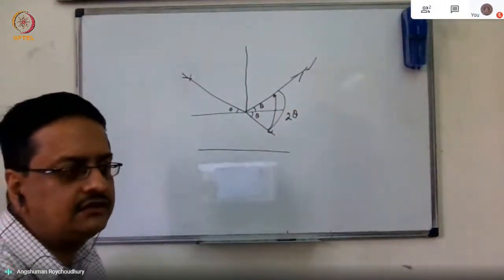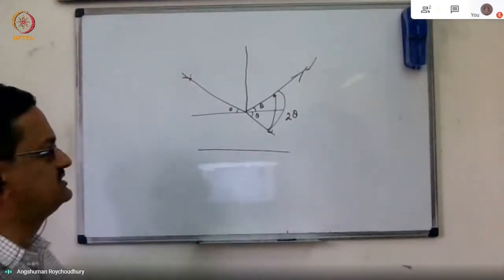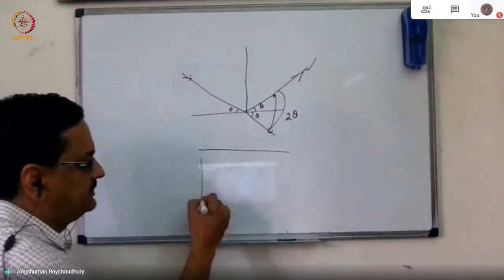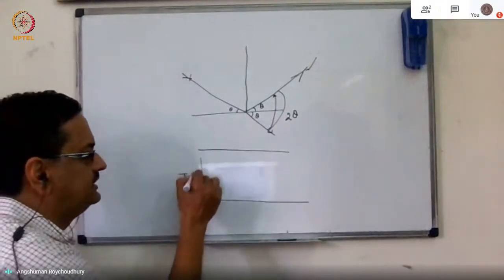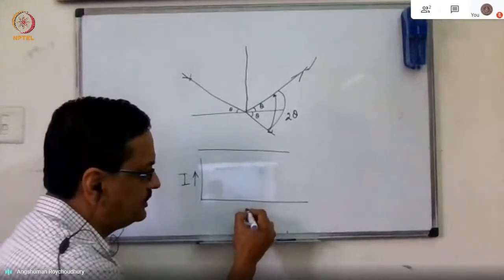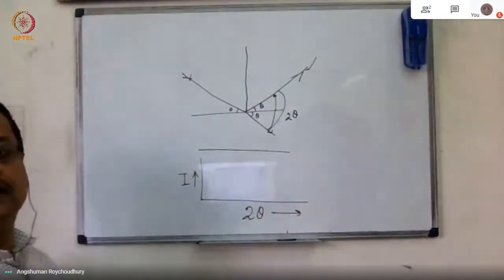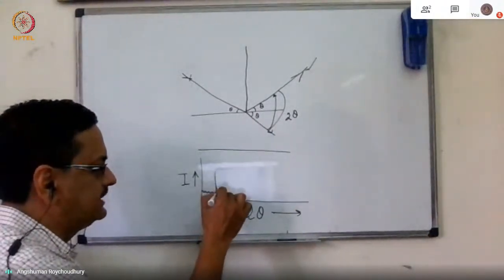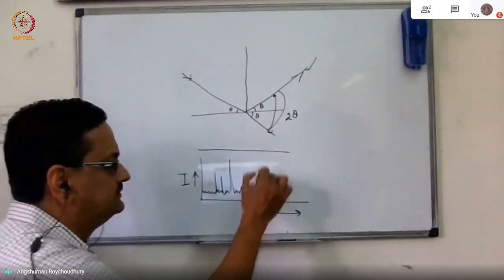So whenever we try to represent the powder X-ray diffraction pattern, which I think the question has originated from, in case of a powder X-ray diffractogram, what we plot are the arbitrary intensity of the diffracted beam in the y-axis, and we plot the angle 2 theta instead of theta in the x-axis, and then we get the diffracted intensities like that, as you have seen in my lecture.